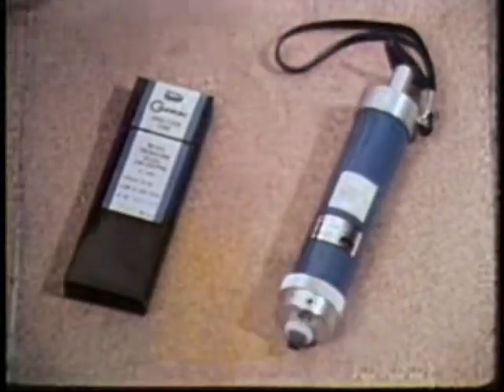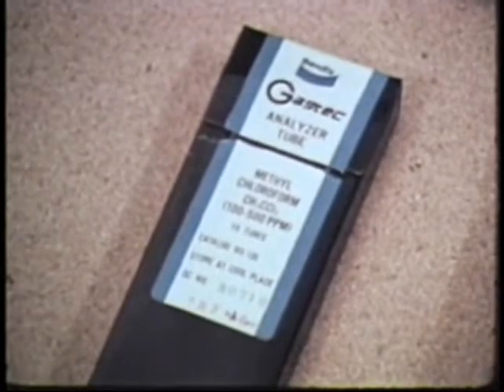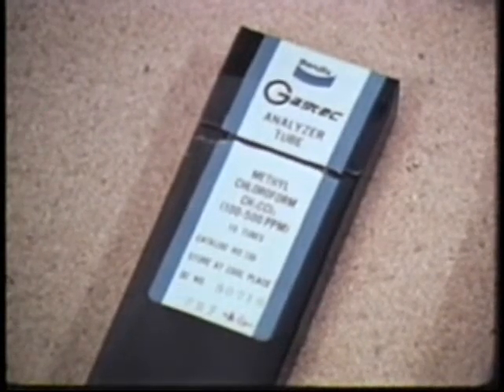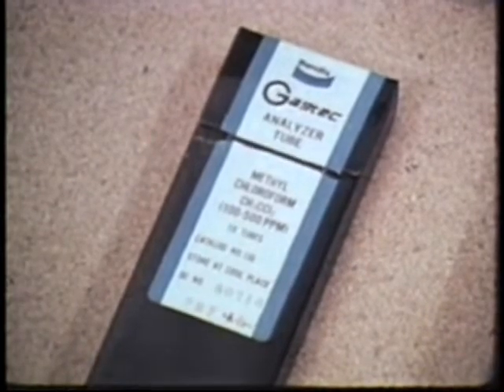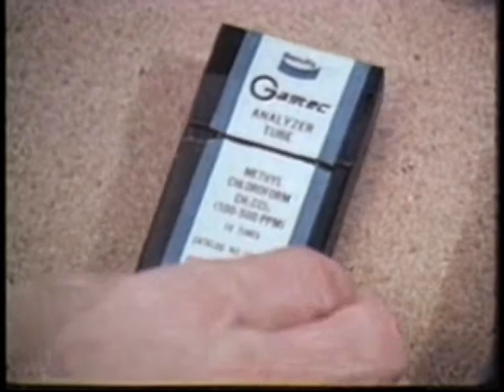This gas sampling pump and these detector tubes. Detector tubes are available for sampling many different types of gases and vapors. Make sure you have the correct type. Also, be sure the tubes haven't reached the shelf life expiration date.